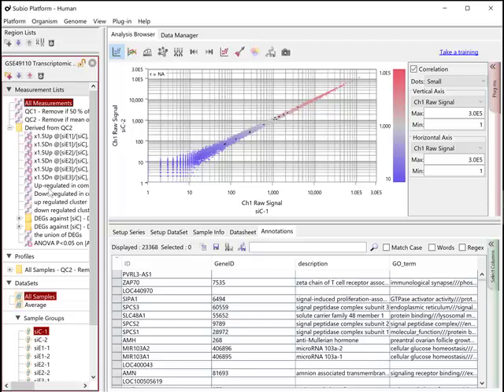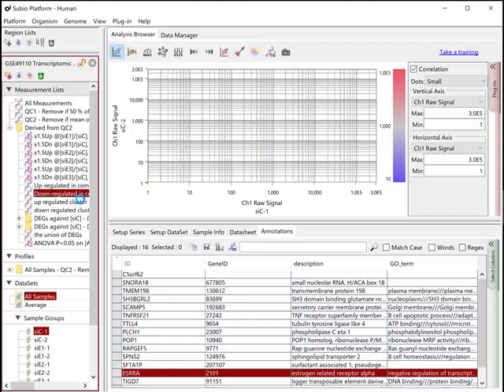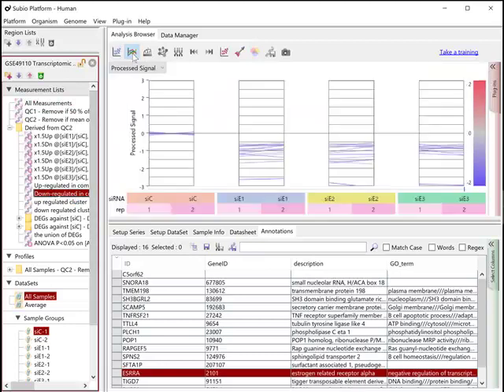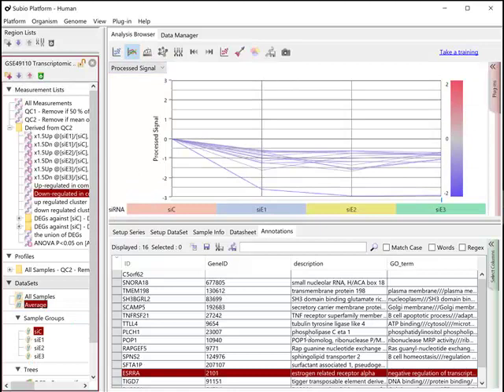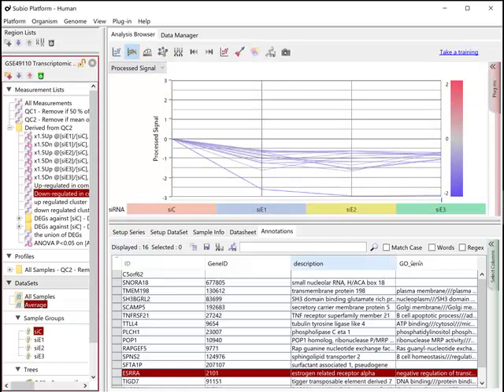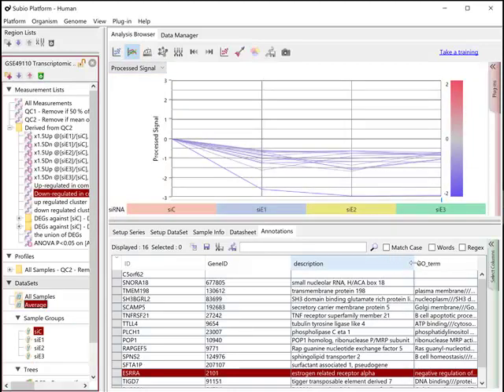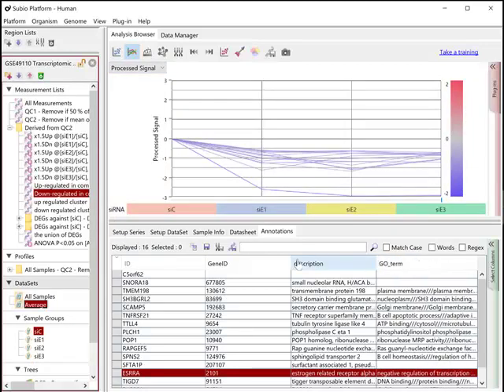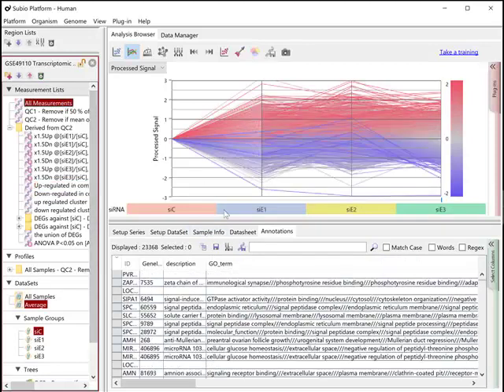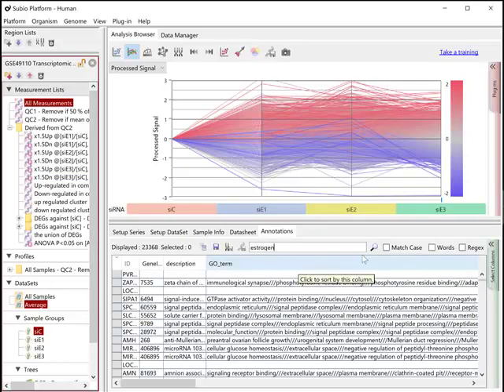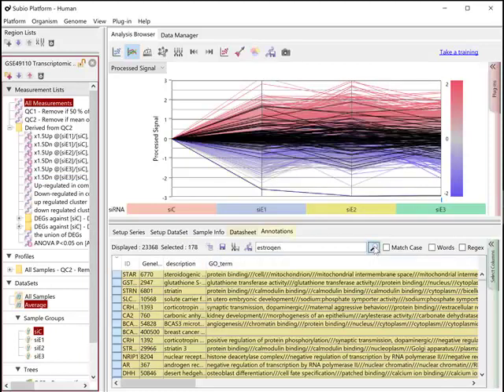As you saw in the DEG analysis part, commonly downregulated genes are significantly few comparing to the commonly up list. Let's collect genes related to estrogen and save the list.